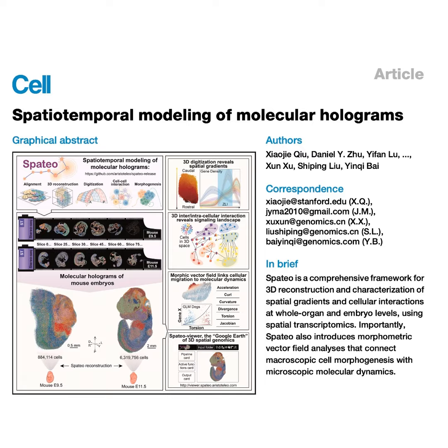Right. Think of a topographic map of a mountain range. The contour lines follow the exact winding shape of the peaks and valleys. By calculating the potential field inside the organ, Spateo basically creates a biological topographic map. So instead of telling the software to look 3 millimeters along the x-axis, researchers can instruct it to track the biological gradient along a specific equipotential line. Exactly. And this reveals the hidden architecture of organogenesis. Using these custom contour-hugging spatial coordinates, the researchers were able to cleanly map the opposing gradients of specific genes like SLIT2 and DBX1 across the developing spinal cord.